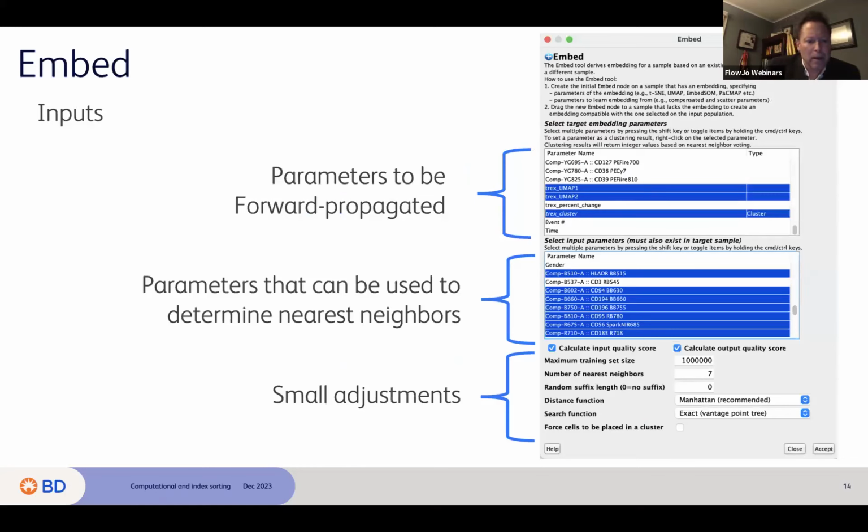Okay. The question: all parameters not appearing in the assigned MEM population name do not show a different expression compared to the reference, right? Correct. Yeah, that's exactly it. MEM is ordering the parameters in the order of importance, so the +10s, if you have any, all the way at the beginning, and then we cut it off at whatever threshold you say is not interesting. Usually we stop somewhere above 0 because it's just not interesting to try to identify what the population is. Good question.